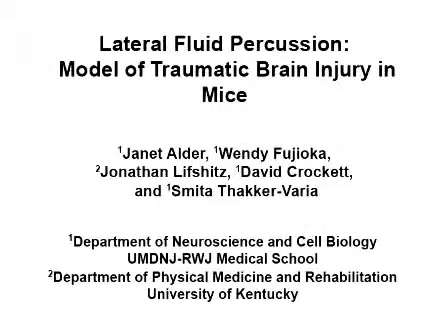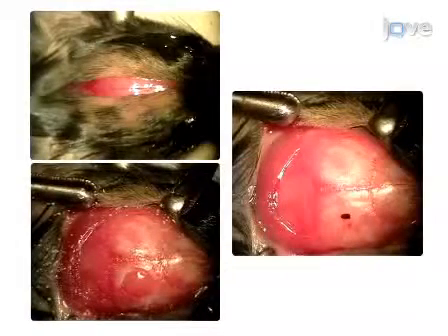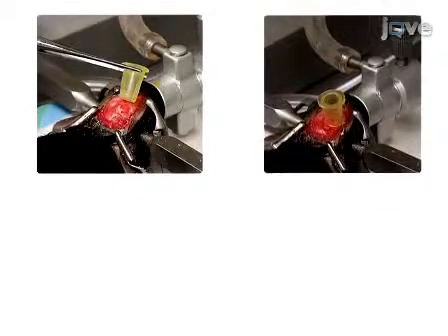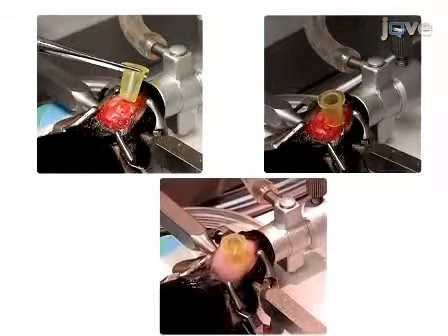The overall goal of this procedure is to induce a mild to moderate brain injury in mice to model human traumatic brain injury. This is accomplished by first performing a craniectomy. The second step of the procedure is to attach a hub to the skull over the craniectomy site.